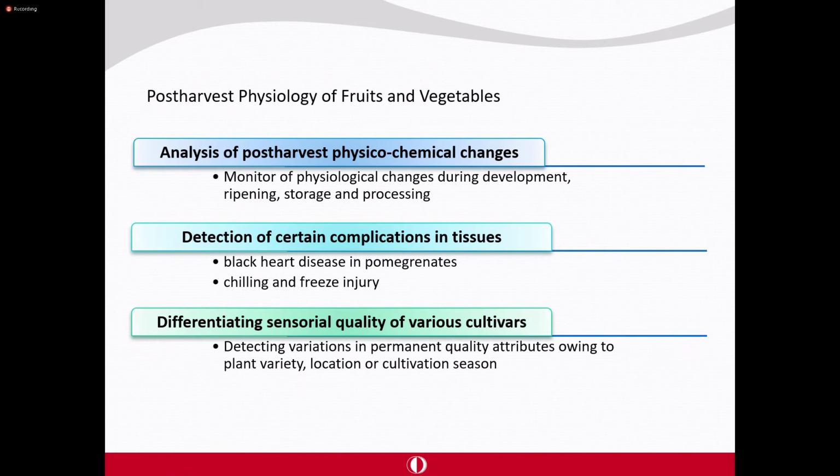And the relaxation times, as given in the relaxation spectrum, can tell us whether the cell is disintegrating or disrupting or not during these physiological changes.